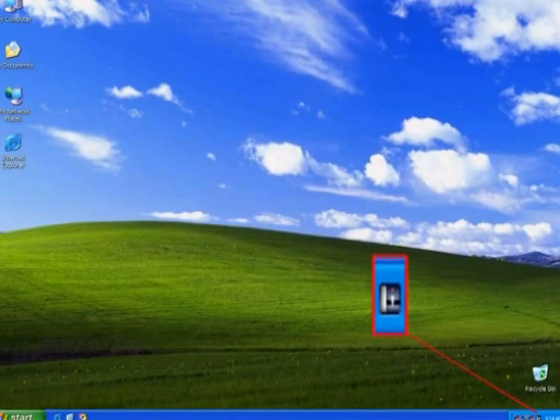The icon for Mosaic Updater should be visible at the bottom right-hand corner of the computer screen. If not, start the software program.